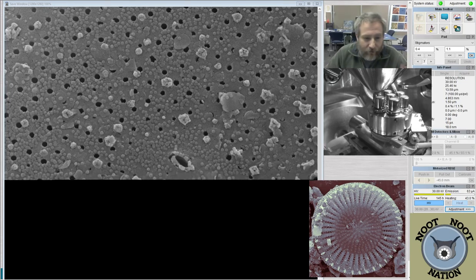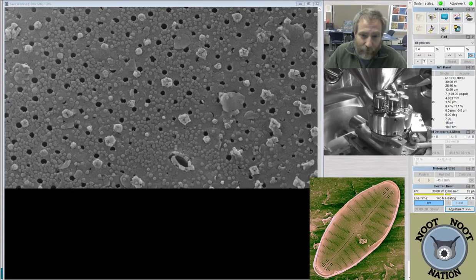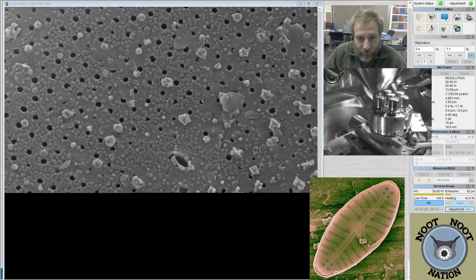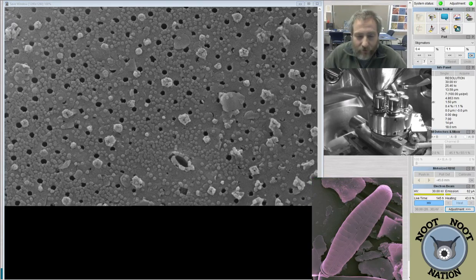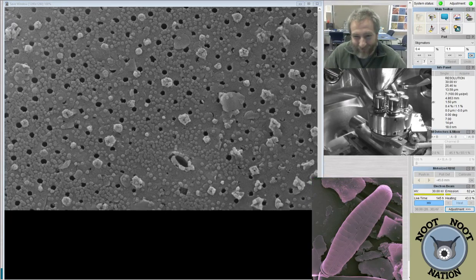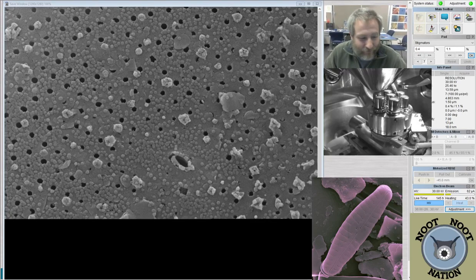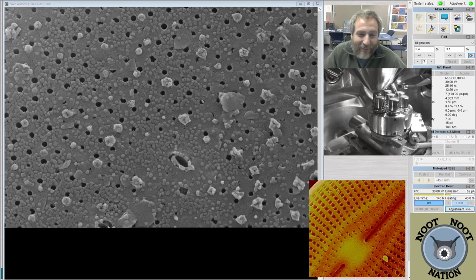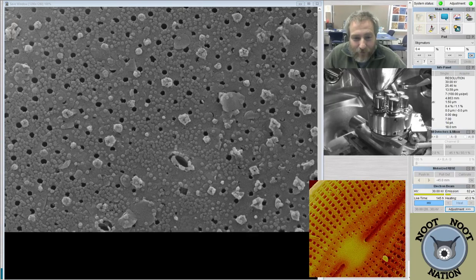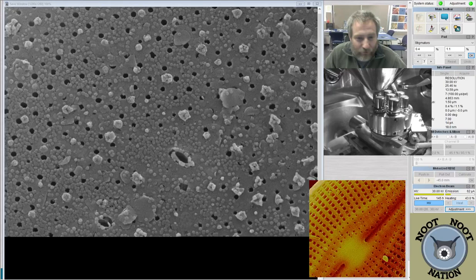I had no idea whether there would be diatoms in the sample. It's completely possible that we would have sedimentary samples from a river that don't have any diatoms at all in them. So it's really nice to be able to find diatoms in the samples. It was what I was kind of hoping for. Otherwise, Mary's going to have a hard time doing a research project on a sample with no diatoms at all. So that's a positive. But yeah, it's always a total mystery what we'll find.